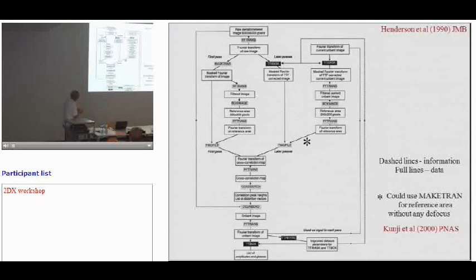And then the final thing, which is this asterisk here, later on, probably about the year 2000, for only one project involving halorhodopsin, where the crystals were very poorly ordered and rather noisy, Edmund Kunji came, and we had this program, which I think Antje is down to talk about, called MakeTran. You take your fully calculated 3D model of the structure, which has been derived from, say, 10, 20, or 100 images that have all been processed using the single image processing software.